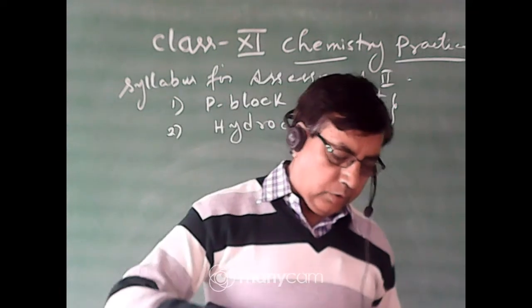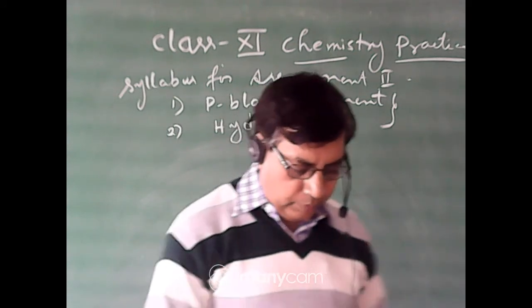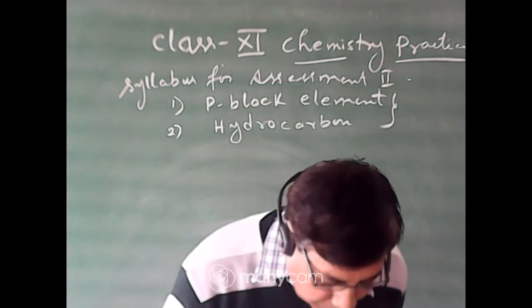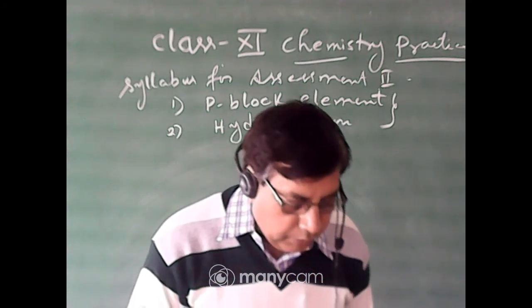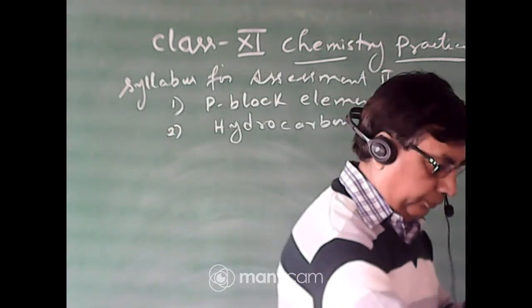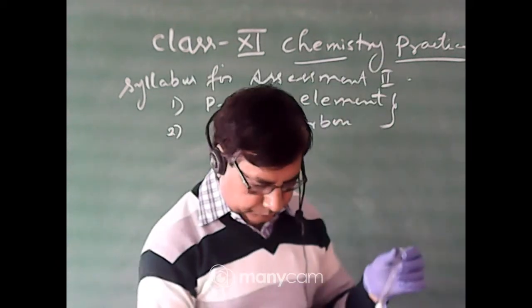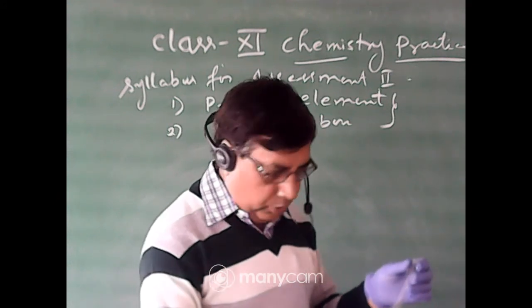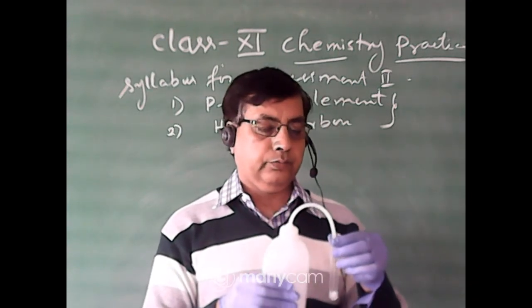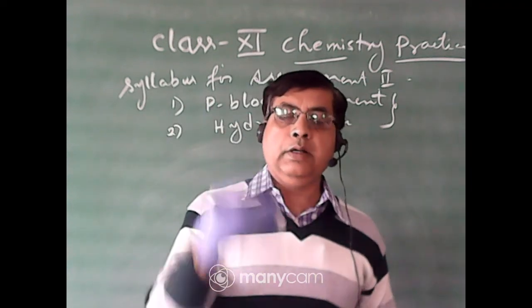Today we do salt analysis with a new unknown salt — this is the third unknown salt. This is a white crystalline salt, and it is soluble in distilled water. We add distilled water and shake well.